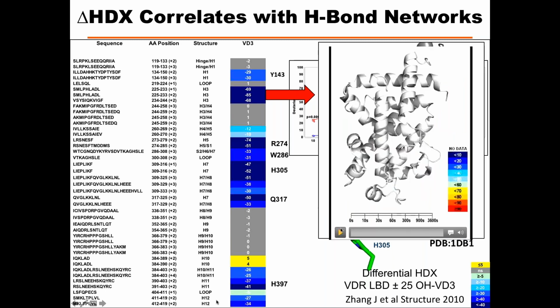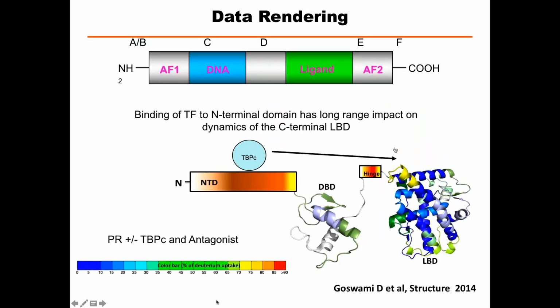But then when you look at the APO kinetics in a video, what you see here is interesting. While the APO crystal structure shows a high degree of order, when you look at the APO protein in the absence of ligand, the exchange behavior of the bottom part, the ligand binding pocket, is very dynamic, whereas the north end is highly stable. And over time, of course, this exchanges out more rapidly. So you get a nice idea of what the APO solution state of the protein looks like.